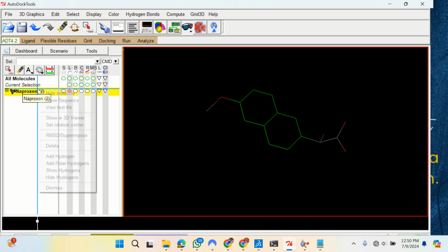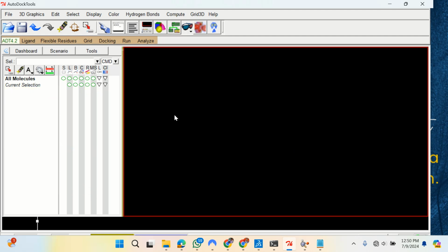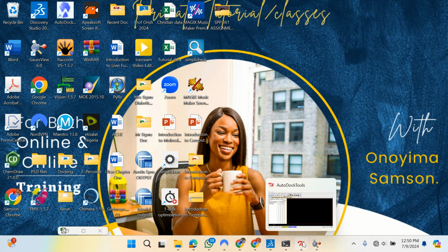So I can go ahead to click here. Right click and click on delete. And this will go. Okay, so I'm done with this. I'm done with ligand preparation. Okay, we're going to do the last portion of this.